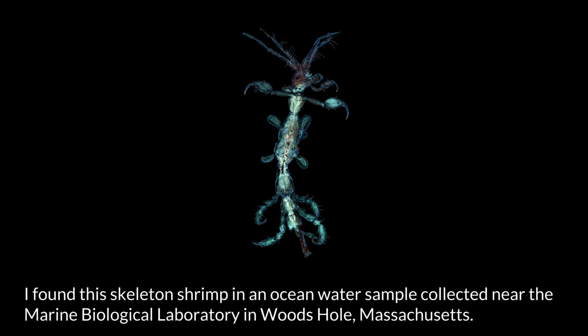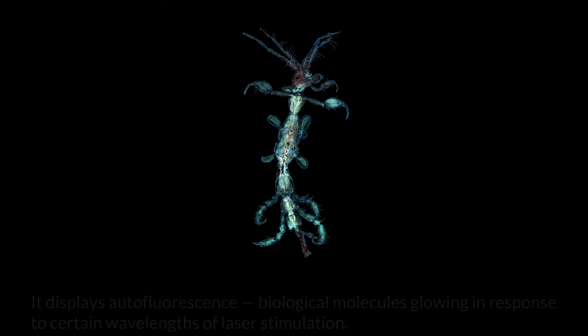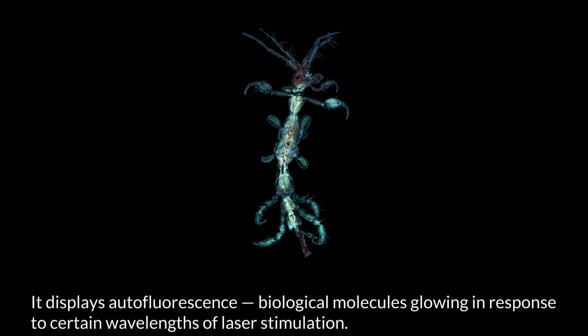I found this skeleton shrimp in an ocean water sample collected near the Marine Biological Laboratory in Woods Hole, Massachusetts. It displays autofluorescence, biological molecules glowing in response to certain wavelengths of laser stimulation.